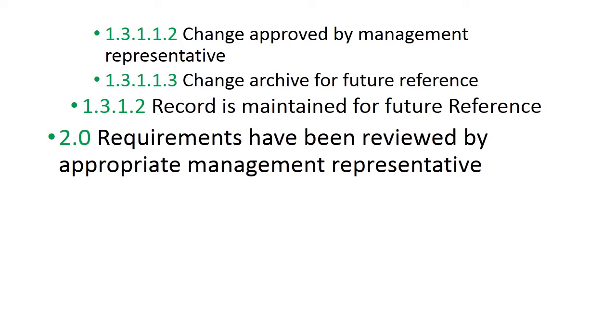Change approved by management representative. Once you justify the need for change in a previously approved document, the laboratory management representative will authorize you to make suitable changes in the standard operating procedures or the design manual of the LIMS software.